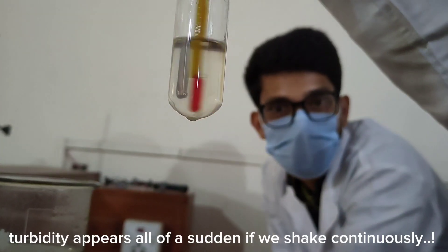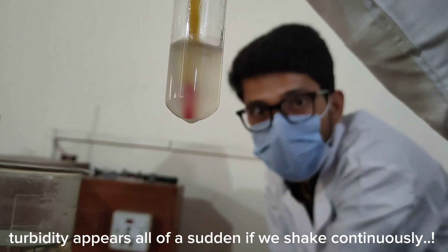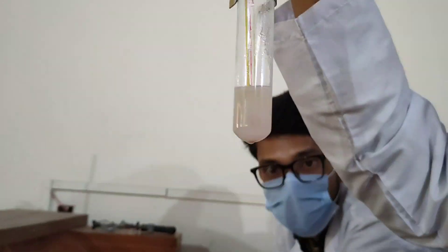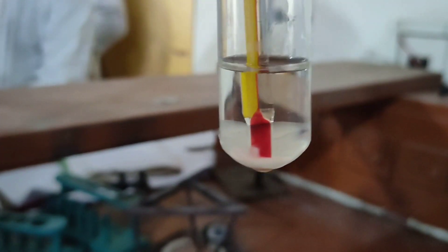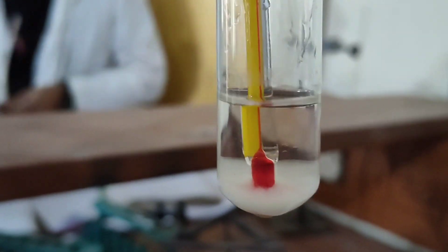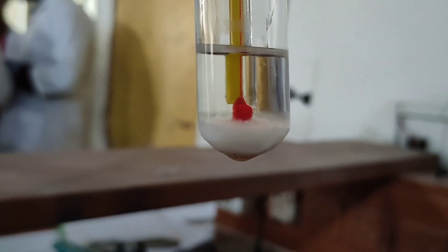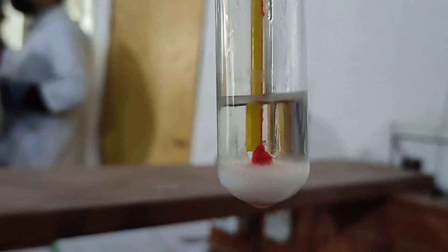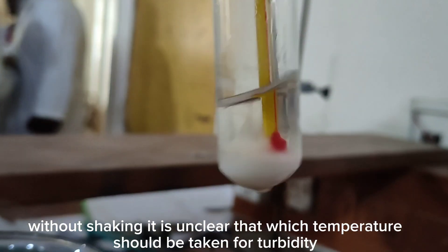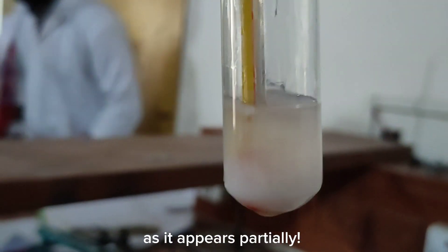Turbidity appears all of a sudden if we shake continuously. Without shaking, it is unclear which temperature should be taken for turbidity, as it appears partially.